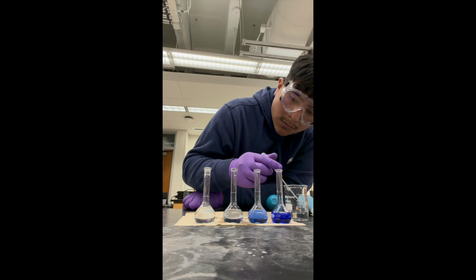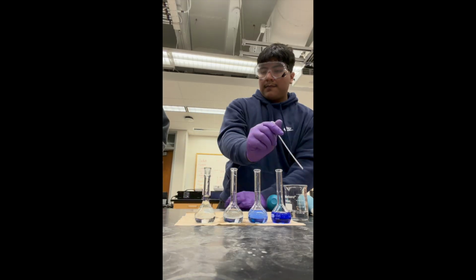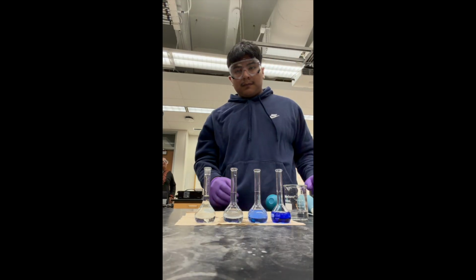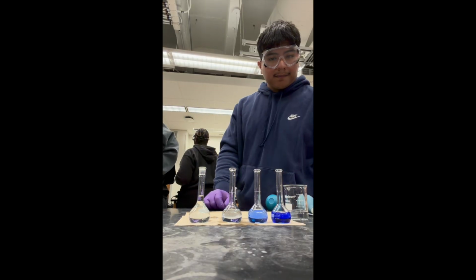Once the 5 milliliters of the second dilution are added, we add distilled water until it reaches the 25 milliliter mark, and that should be the end of the last dilution. This is the third, the second, the first, and the stock of the dilution.